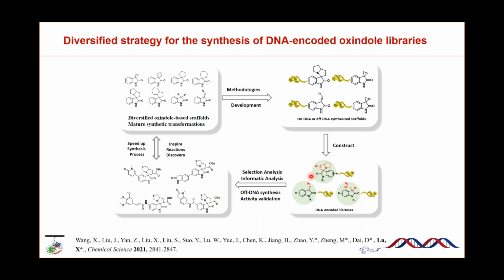And specifically, we have used the oxindole scaffold as an example to apply the DOS concept for different types of focused single libraries. For the scaffold, we not only developed some novel DEL chemistry to synthesize this type of spirooxindoles, we also used traditional organic synthesis to synthesize the scaffolds. And finally, we have built these three new single libraries with several protein targets. And we have demonstrated that this diverse range of single libraries could find interesting hits for many protein targets.